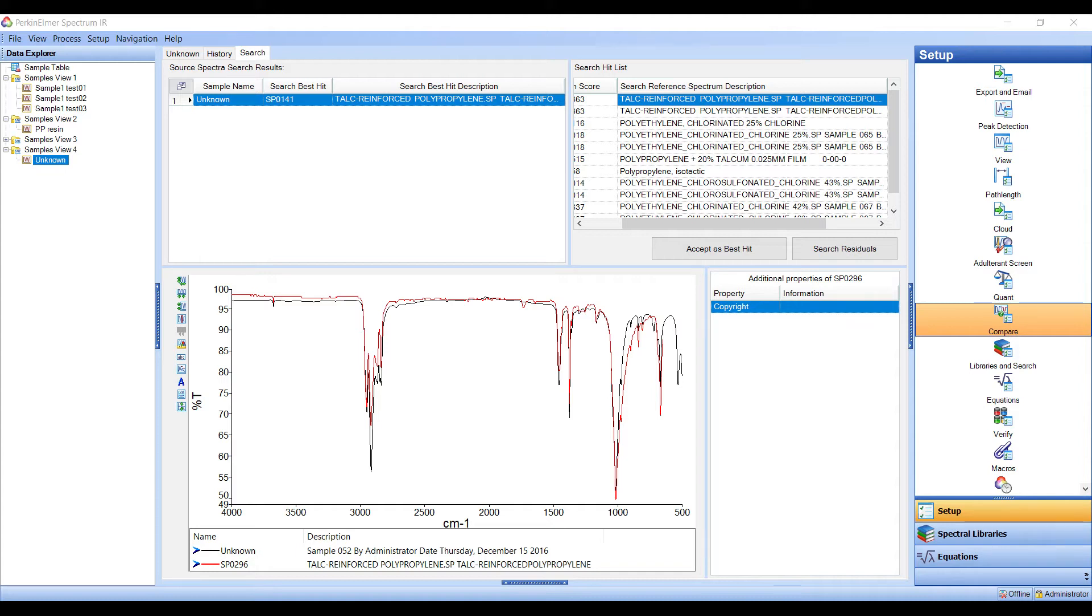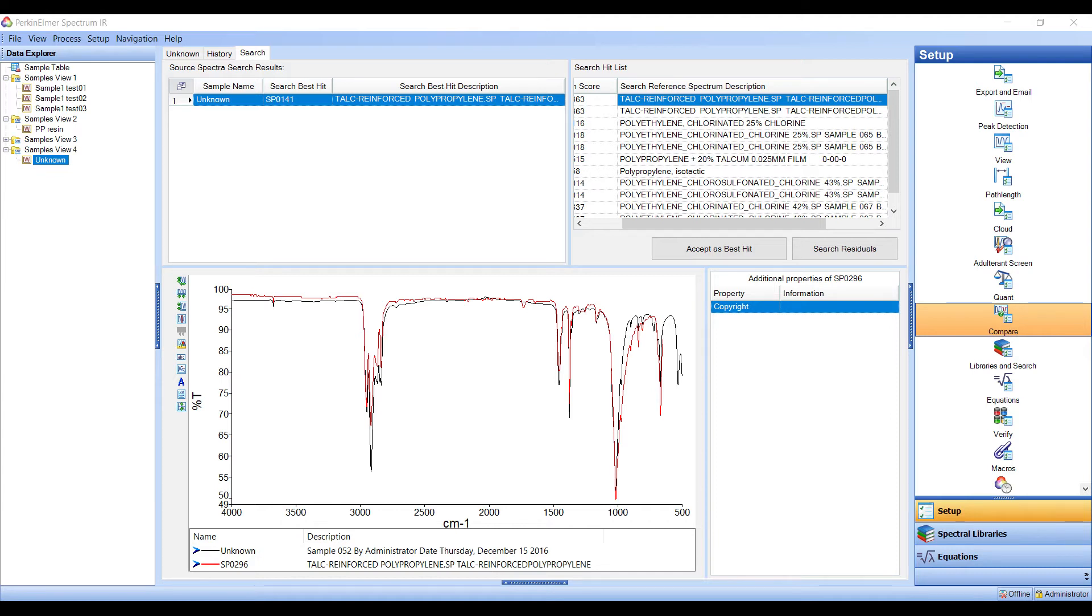As with the Compare algorithm, the degree of correlation between the sample spectrum and the reference library spectra is calculated. The results are sorted based on the correlation value, with the idea that the most similar spectrum will rise to the top. This allows users to very quickly and easily identify unknown materials.